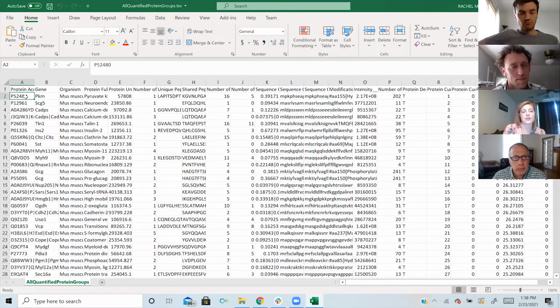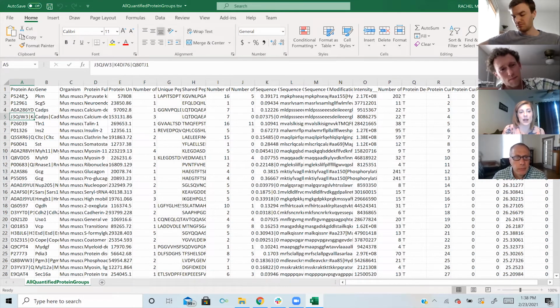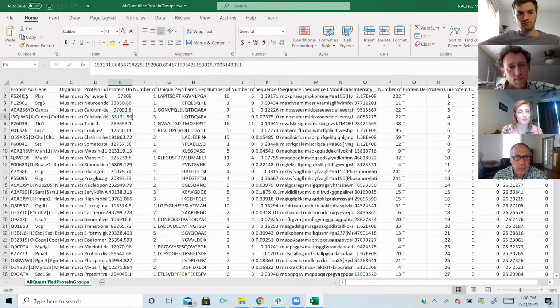Here, we are able to determine that this single protein is in our sample, or this is how we display protein groups. These 3 protein accessions, we can't distinguish based on the peptide evidence that we have if one is in the sample, if it's a subset, or all of them. So we display all equally here.